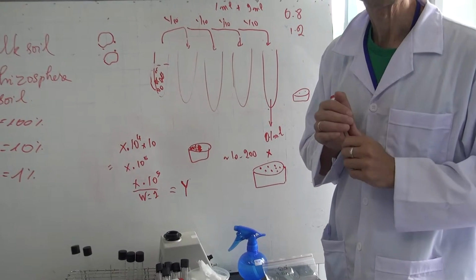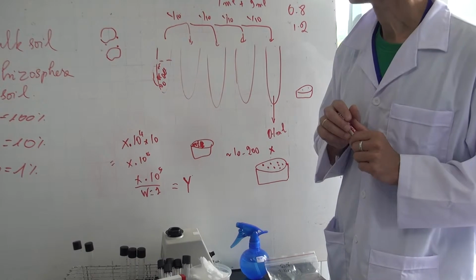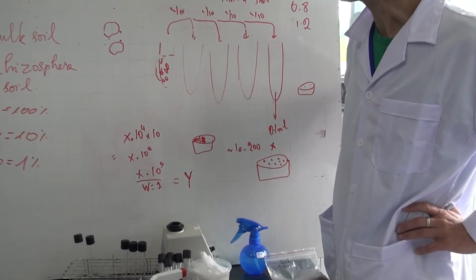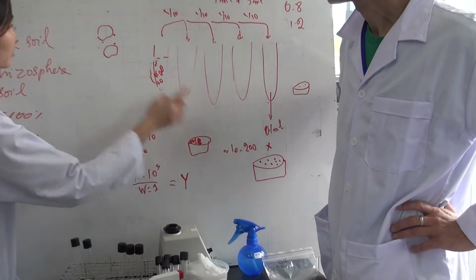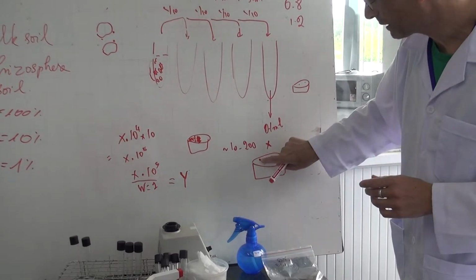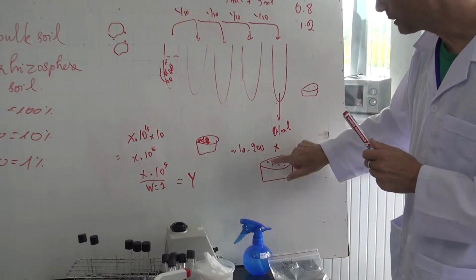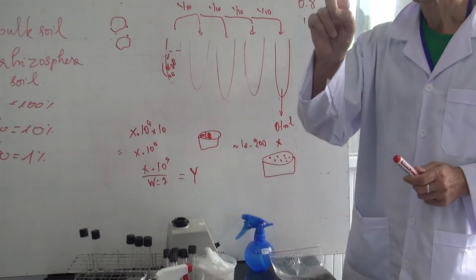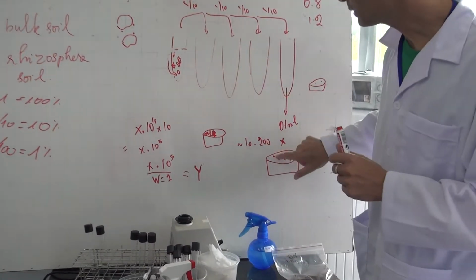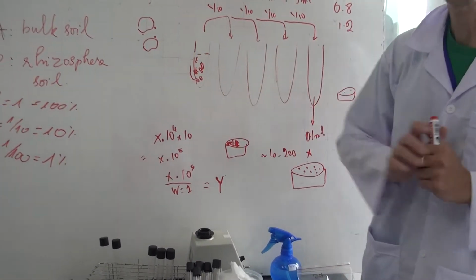Tính bằng CFU, tức là tại vì một cái khuẩn lạc như vậy thì nó có thể là những cái tế bào vi khuẩn hay dính chùm lại với nhau trong một khuẩn lạc đó. Có thể là có 2-3 tế bào trong một cái khuẩn lạc. Because it's one colony not representative of one cell. Very good. Because one colony here, we assume that each colony here comes from one cell. If that would be true, then indeed each colony would be one cell, and that's fine to think that we actually have the number of bacteria from the soil.